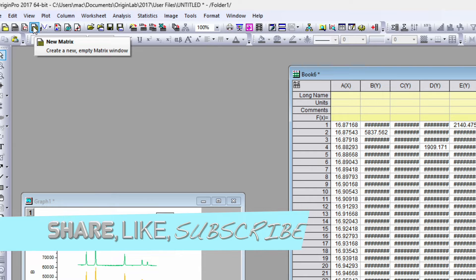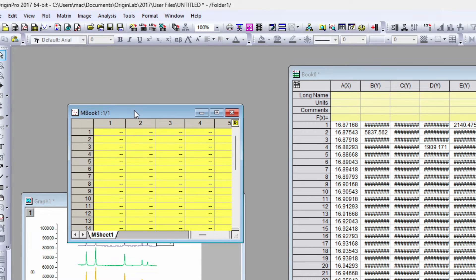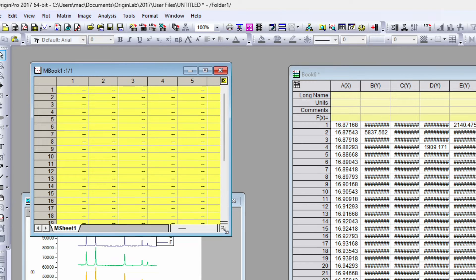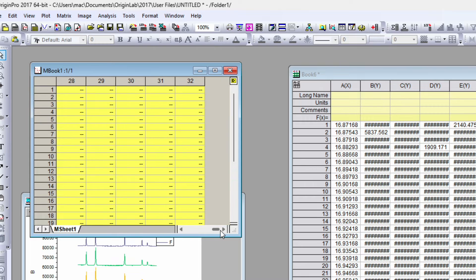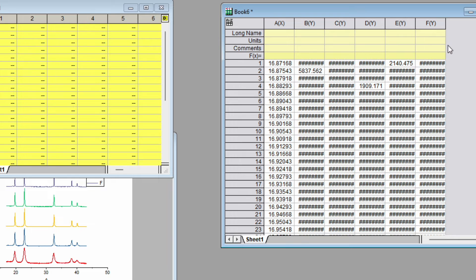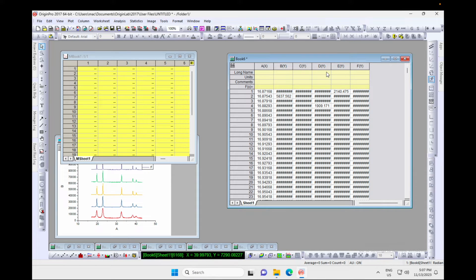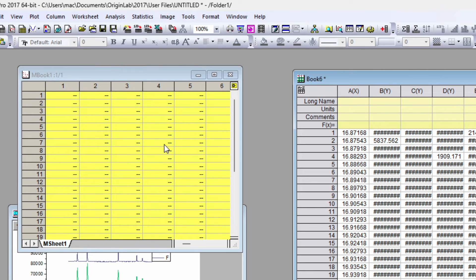Go to the top left corner and you'll see an option for 'New Matrix' — click it and a new matrix will open. The default matrix shows 32 columns and 32 rows, but in our case we have 5 columns and roughly 7000 rows. In the 3D/2D plot, the x-axis will be 2-theta and the y-axis will be the temperature (400, 500, 600, 700, 800°C), so we'll have 5 rows and 7000 columns.